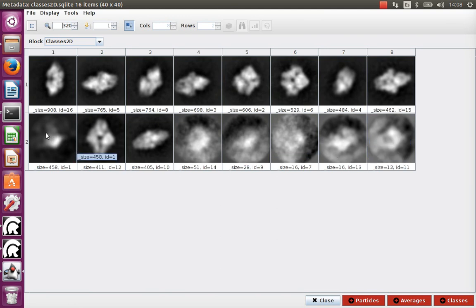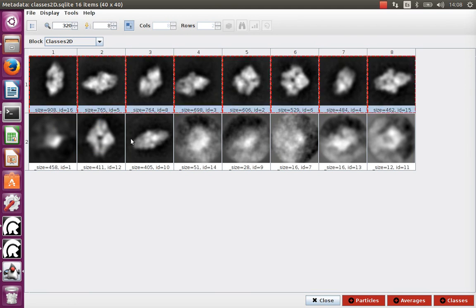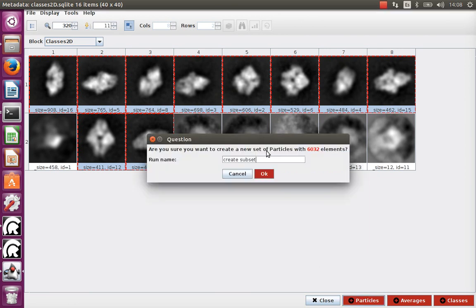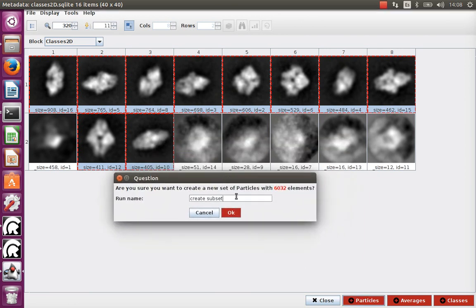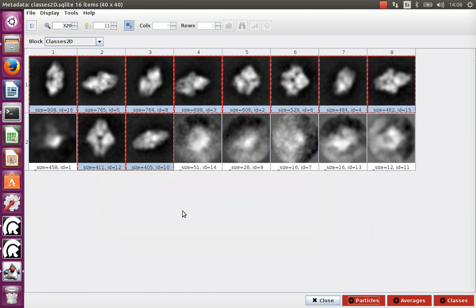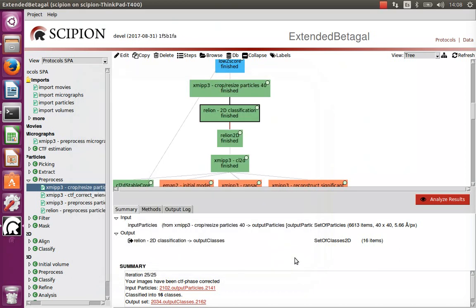At this point we select the good classes and generate a new dataset with the images we think are good. There were about 6,600 particles at the beginning, so about 10% of the images have gone to garbage classes.